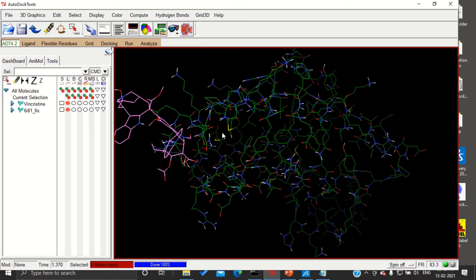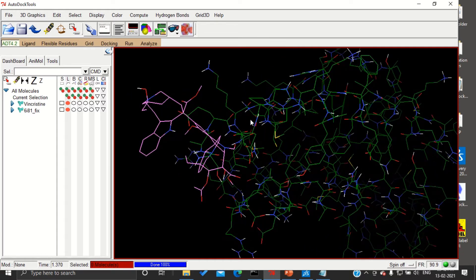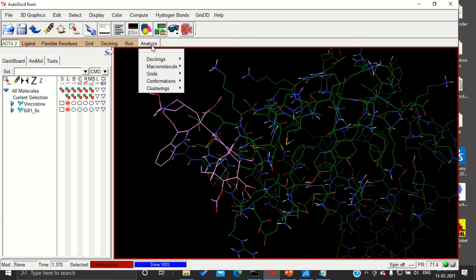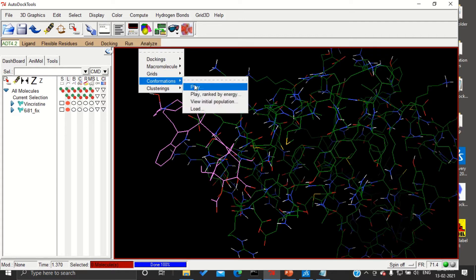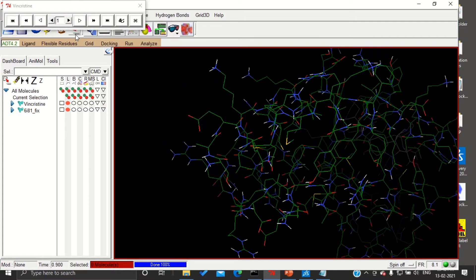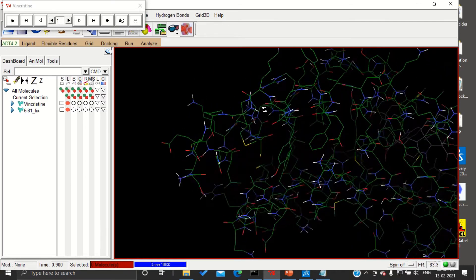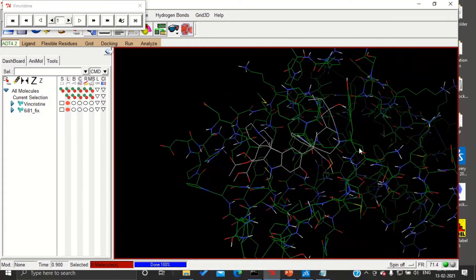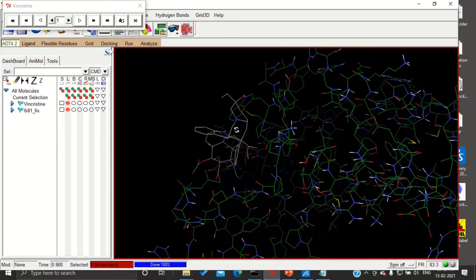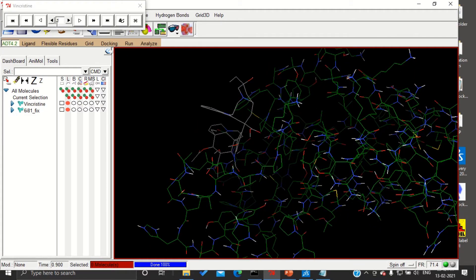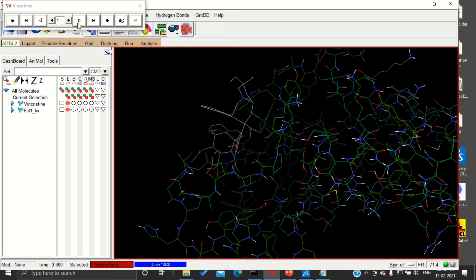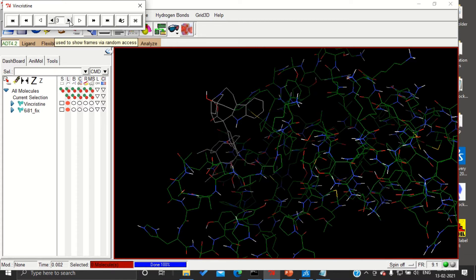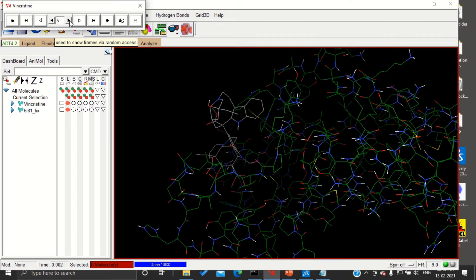Now you are able to see the conformations at which we got very good results. That is run 5. Go to analyze conformations, play. Here you can see our drug vincristine in conformation number 1. It was binded like this. If I keep changing this, you can see the changes in the conformations: 3, 4, and 5.